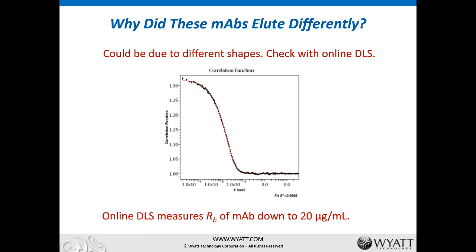We find the molecular weight from column calibration on the UHPLC platform can give actually more wrong answers comparing to the SEC platform, probably due to its very steep calibration curves.